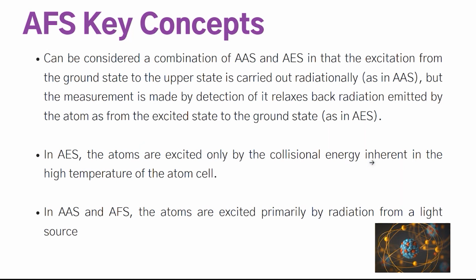Now, AFS can be considered a combination of AAS and AES in a way that the excitation from the ground state to the upper state is carried out radiationally, such as that in the atomic absorption spectroscopy. But the measurement is made by detection of the radiation emitted by the atom as it relaxes back from the excited state to the ground state.